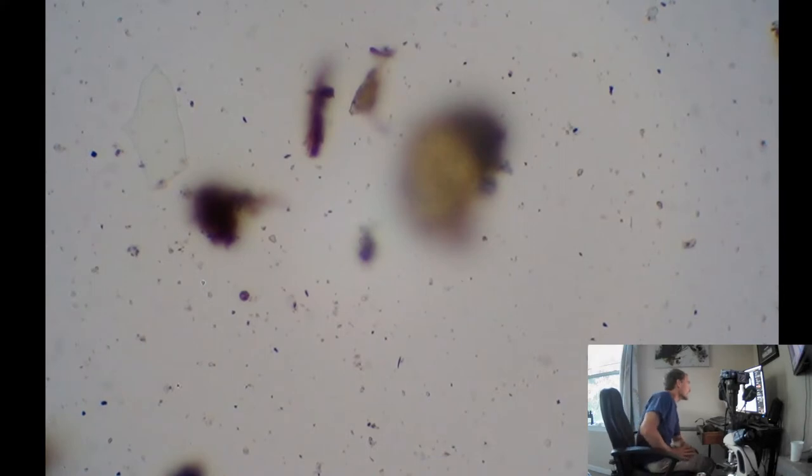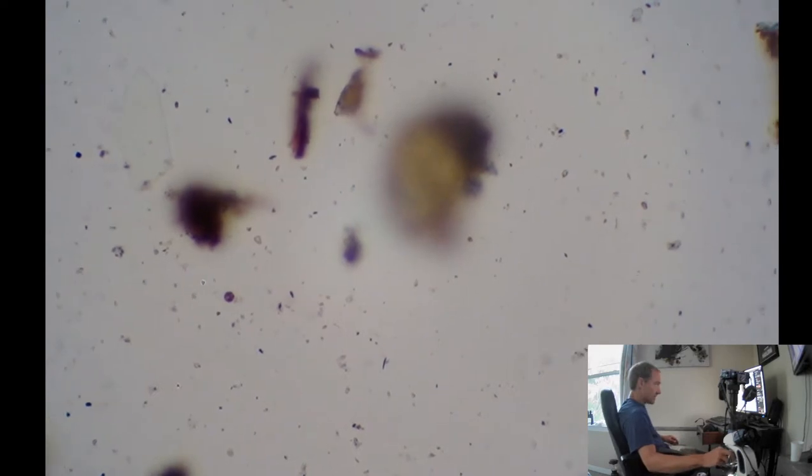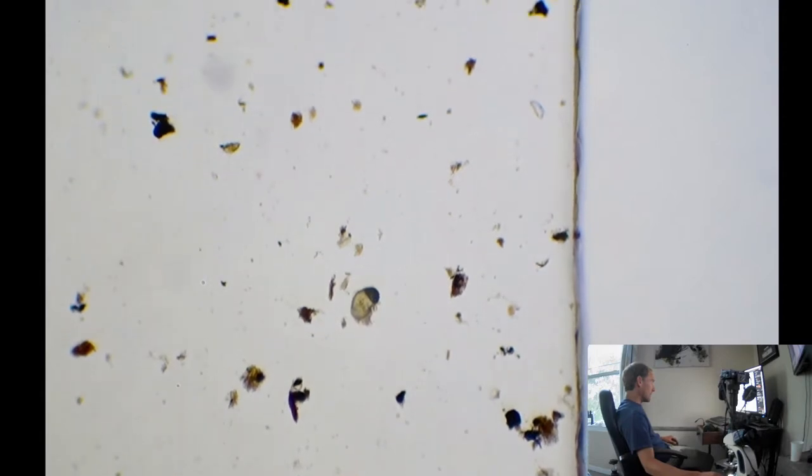Alright. Let's take a quick look for what we see in bacteria in there. Yeah, we got a bunch of different little shapes and sizes bumbling around. That's looking like a pretty healthy amount of bacteria. Alright, let's bounce back out to 100. And adjust our light a little bit here. Yeah, right about there.